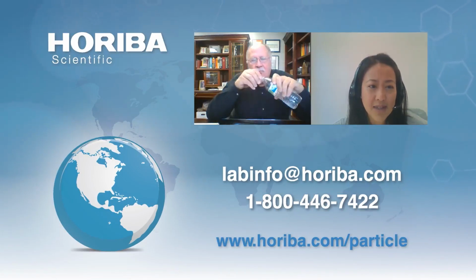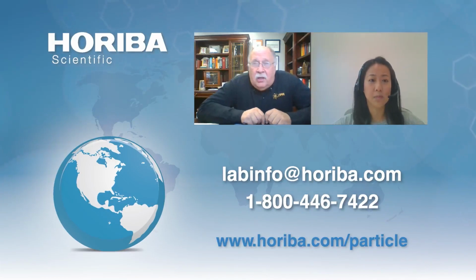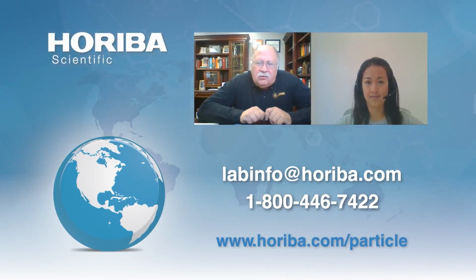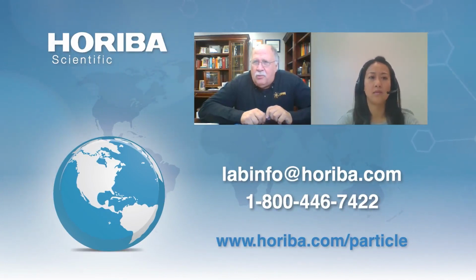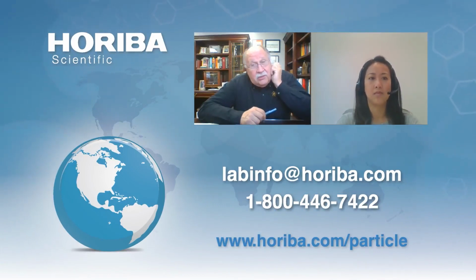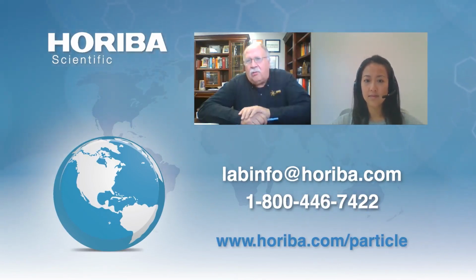The next question is, how do you take care of all the extra fines generated during ball milling? Wow, that is a great question. Ball milling has a tendency to give a longer tail. I have an example that I've used other times that shows the difference between jet milling and ball milling. Where fines become very important in ball milling, people will go from a batch process to a swept ball mill, so it's a continuous process. They'll move the finer particles out so they don't become overground. So the way you deal with it is you minimize your grind times, either by removing the material very quickly or by just doing a short grinding time.